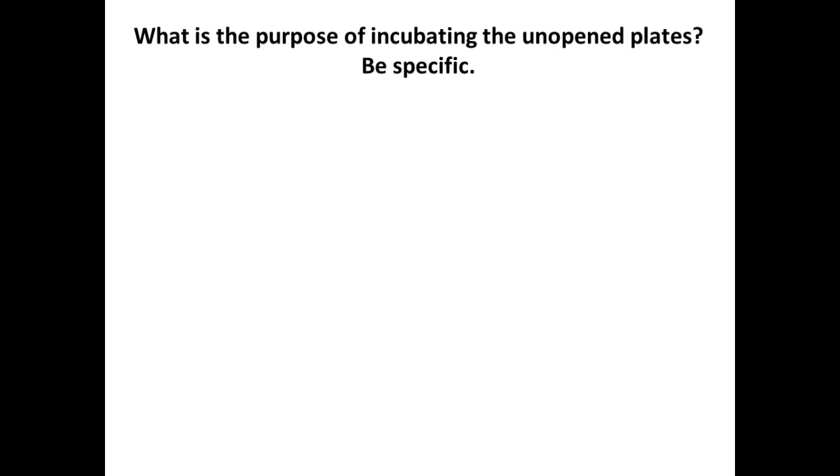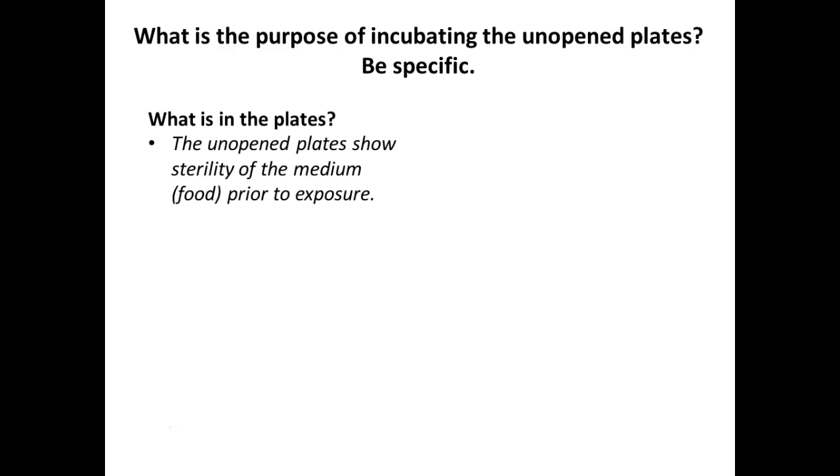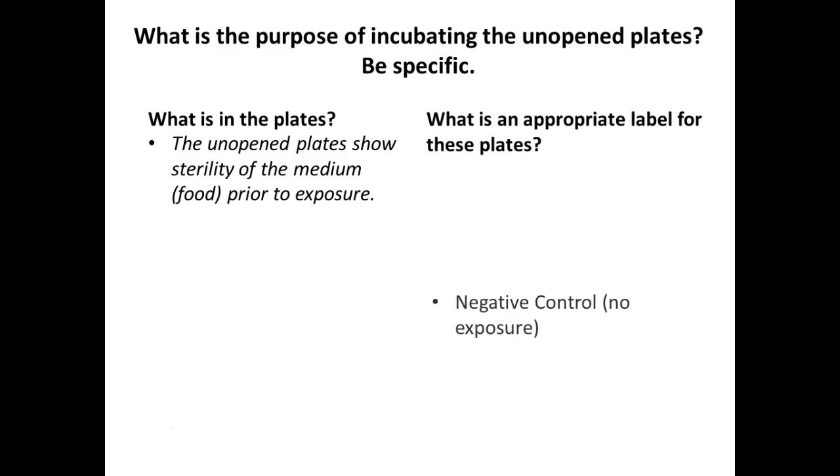So what's the purpose of our unopened plates? What's a label that we put on them? Negative control, right? They show sterility of our media, the food that we have there for the microorganisms to eat. So our appropriate label is negative control or no exposure.